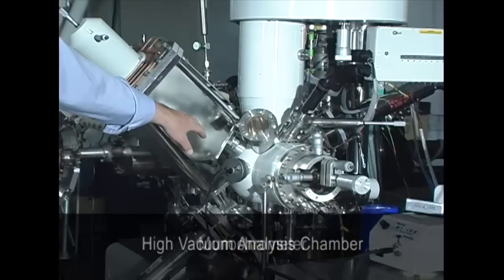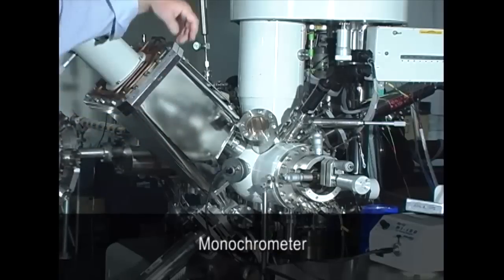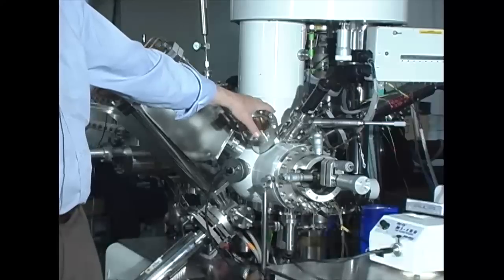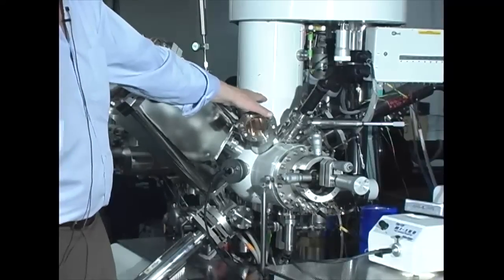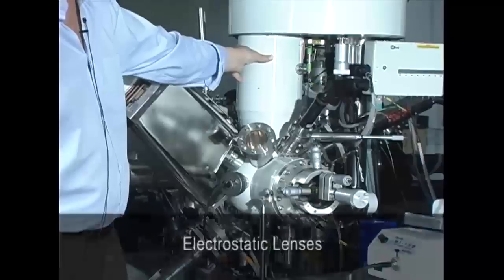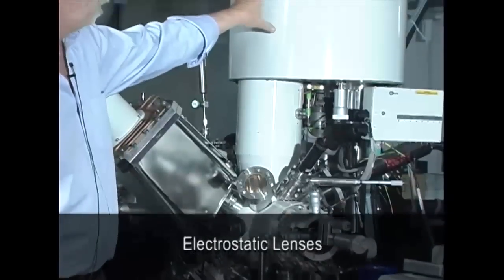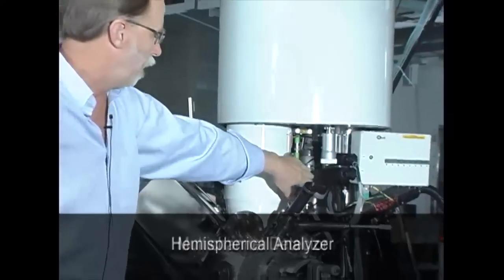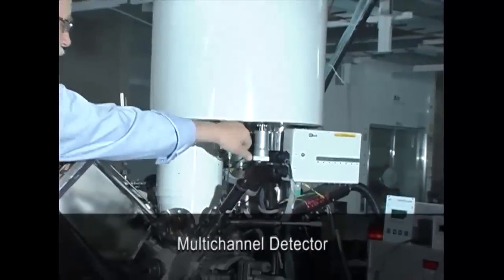Excitation by either X-rays through this monochromatic source here or UV photons back here creates a photoelectron emission from the surface that's collected via these electrostatic lenses inside here, and finally a hemispherical analyzer here with multi-channel detection there.